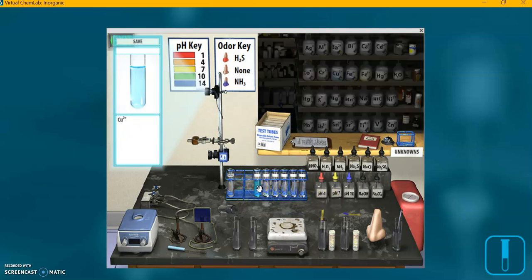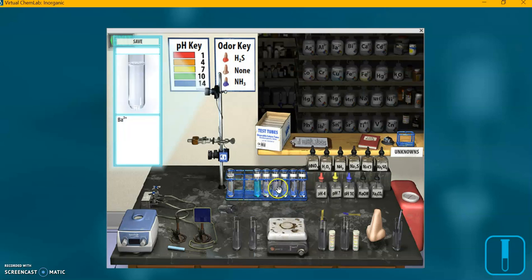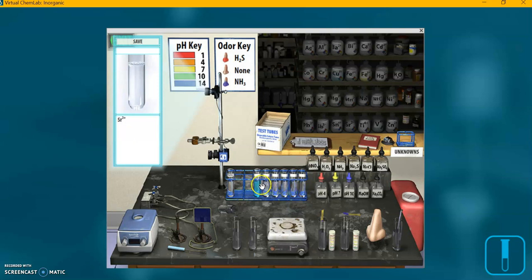So again, now that we have our lineup of test tubes, you can scroll mouse over each, and it shows you in the zoom in window what's in that test tube. It's kind of a handy thing.